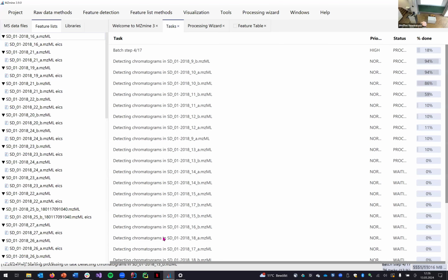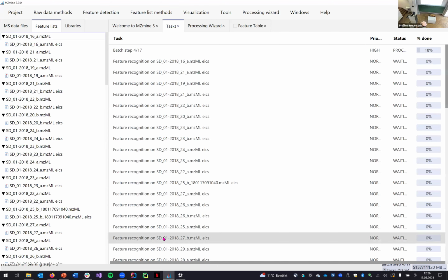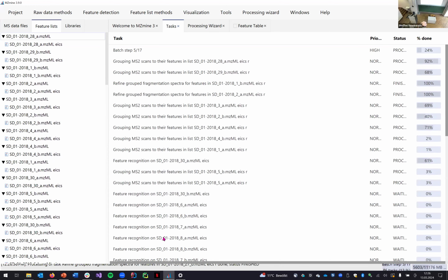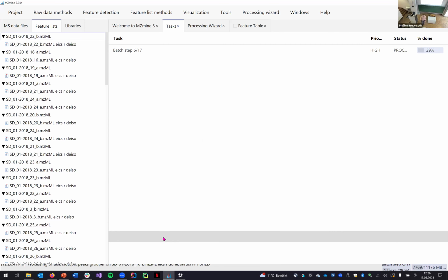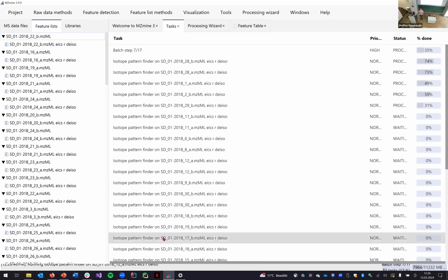Let me check. So this one is probably, so now it should work. Basically, we can remove this one. And now just create batch again, and then it should run. More questions? More issues?